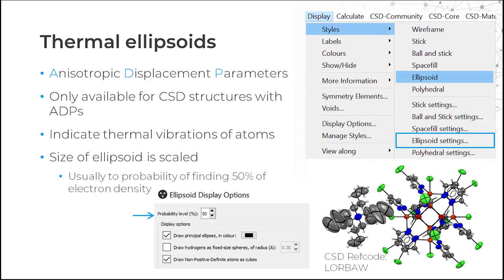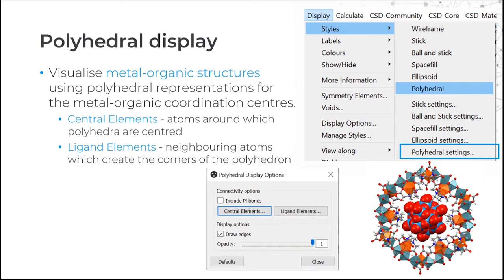There are settings you can change for the ellipsoid display by going to Display, Styles, Ellipsoid Settings. For example, you can change the probability of finding the electron density — it's normally set at 50%. If you're looking at metal-organic structures, you might be interested in the polyhedral display option, found under Display, Styles, Polyhedral. The central elements are the atoms around which polyhedra are centred, and the ligand elements are neighbouring atoms which create the corners. You can also make the polyhedron more transparent.